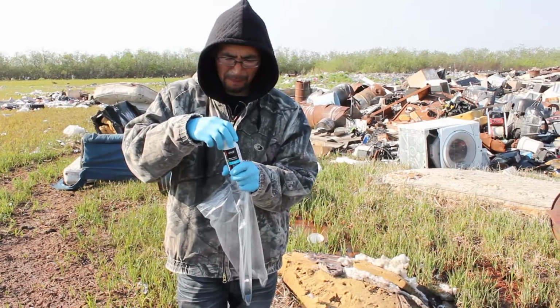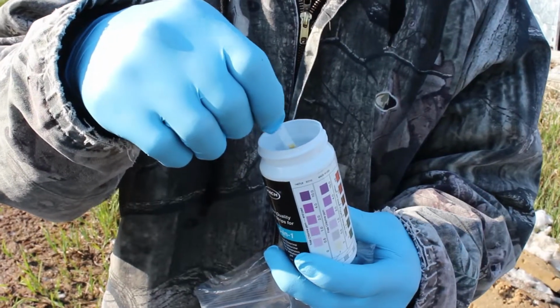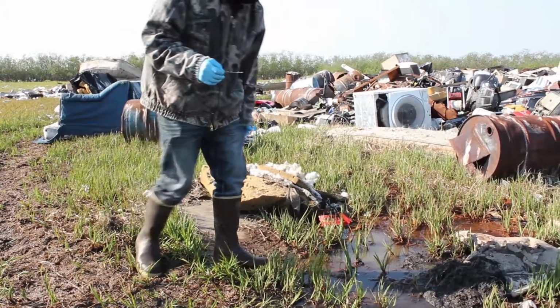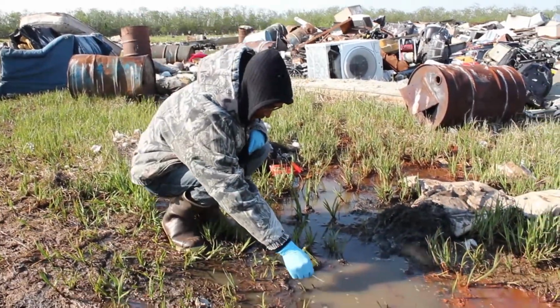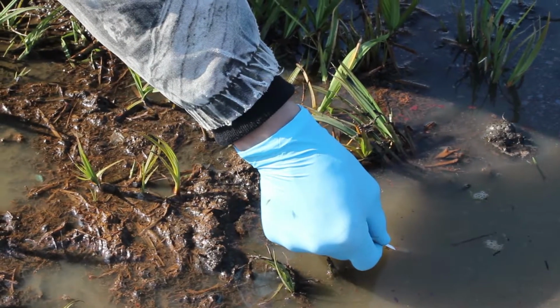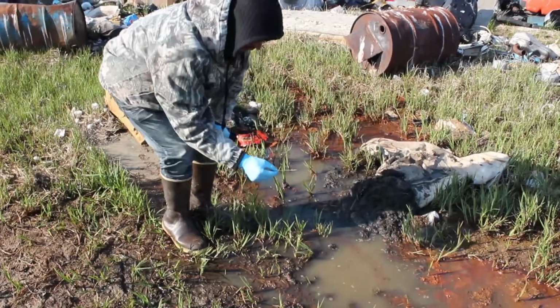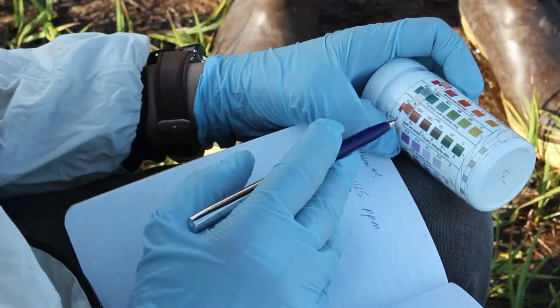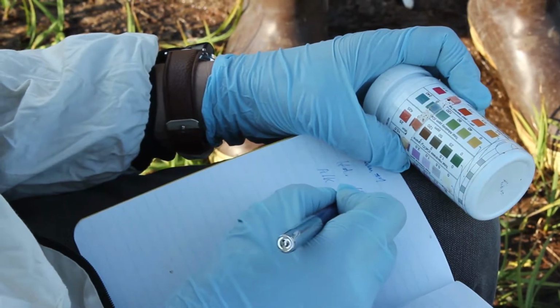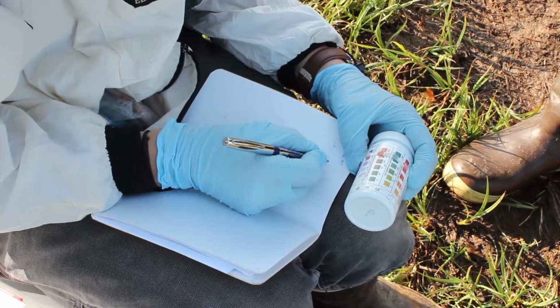Be sure to remember to use gloves and avoid contaminating your samples. Change your gloves at each sampling site. To determine the pH of a sampling site, place the pH strip into the water and hold it there for 2 or 3 minutes or whatever time is written in the instructions on the bottle. Remove the strip and compare it to the colors marked on the bottle. Choose the closest match to determine the pH and write it down in your data sheet.